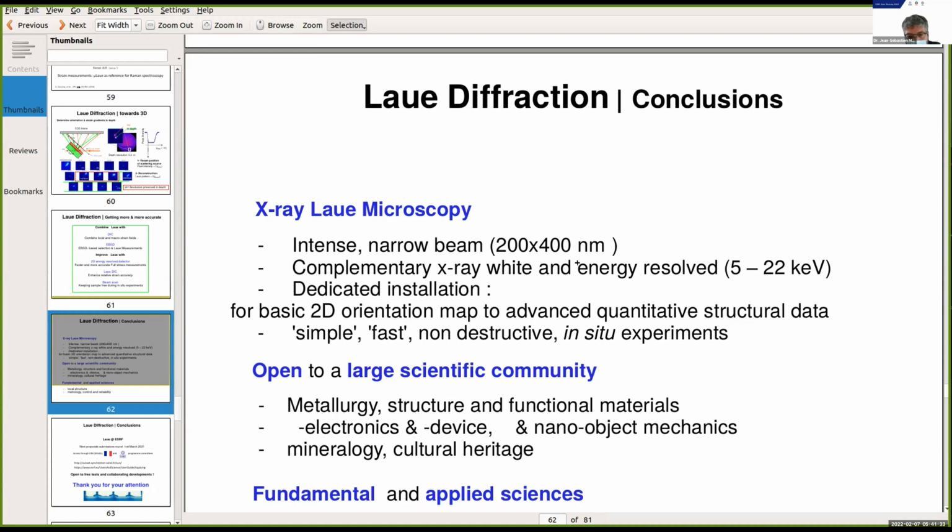But we also already have the way to measure the energy, and as a reminder, if we are able to measure the energy, we have the complete determination of the full strain and full stress, which is very important. So full strain or full lattice parameters for fundamental or technological applied materials, and full stress for the engineering part.